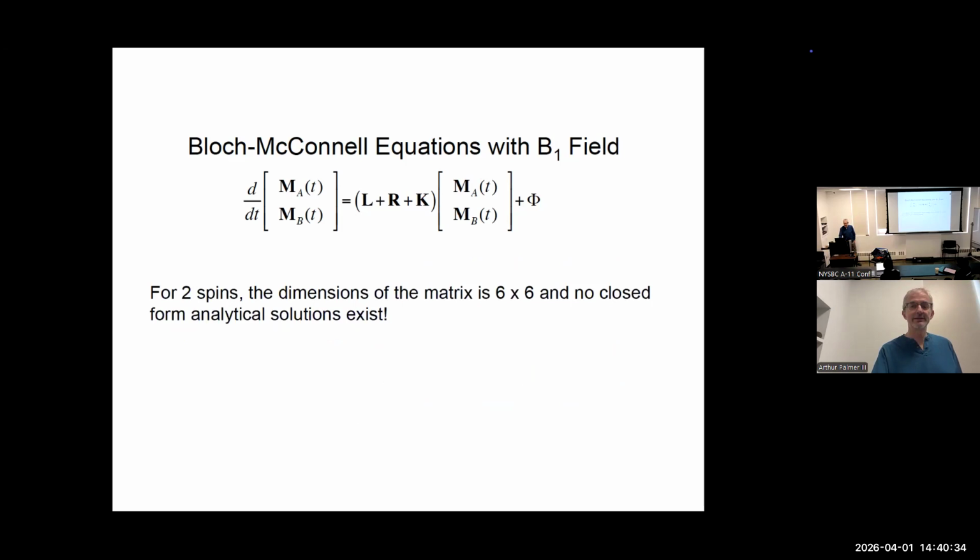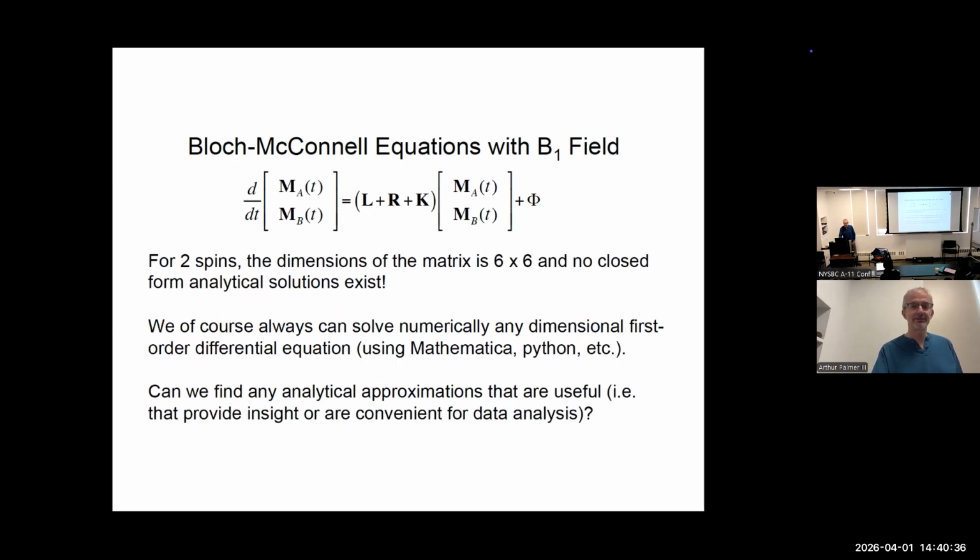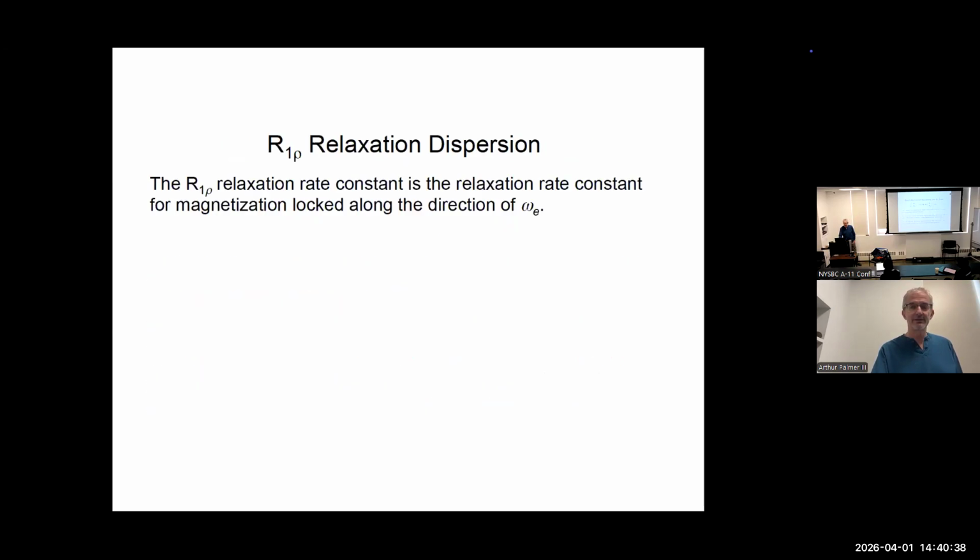What if you were in a subspace, so the transverse is just one complex number, or the Z is just one, and you say those are not going to exchange? Right, but once you turn on the B1 field, they're coupled together by rotation under the B1. With the B1 field, you're... Yes. Yes. Free precession. Yes.